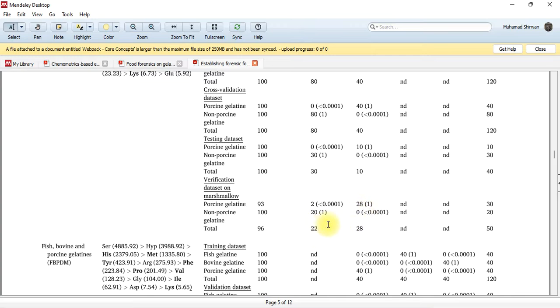So this is how we look at the results. People are very likely to publish papers when you can prove it in actual samples. Even if it is not that good, if you can use it on the actual sample, people will note that at least someone has tested it on the actual one. We don't merely claim here and there, writing everything to be top of the sky, but in actual samples, nothing can be produced. So this is an example.